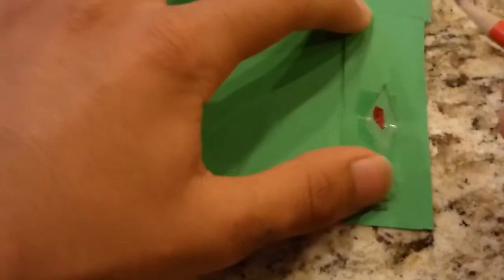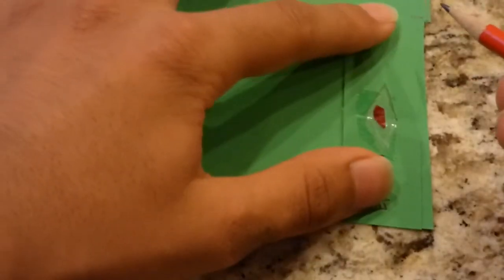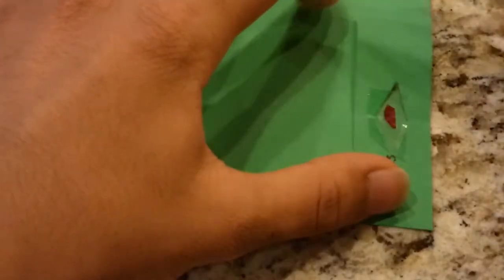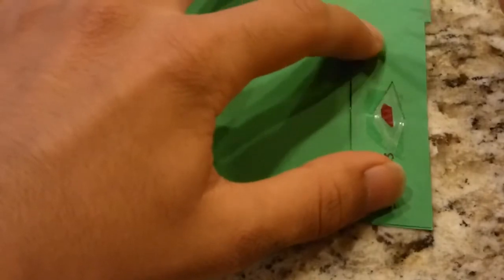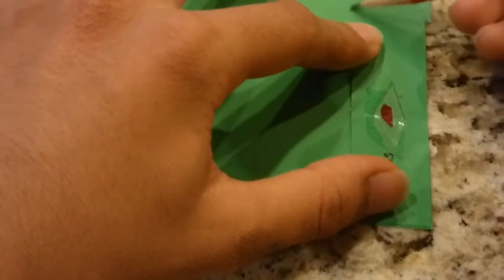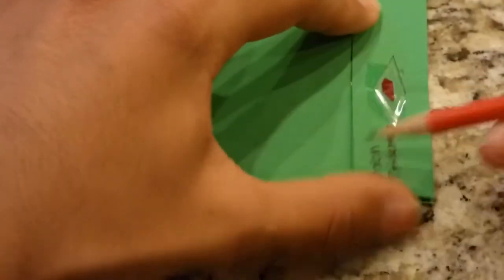Using our template, we're simply going to mark off a section on our cardstock. Once we have that section marked off, we can easily cut it out.